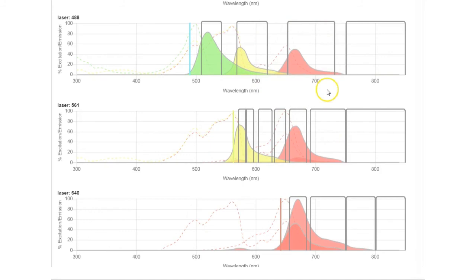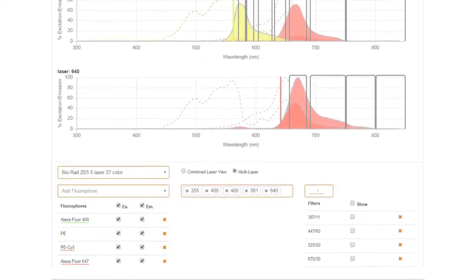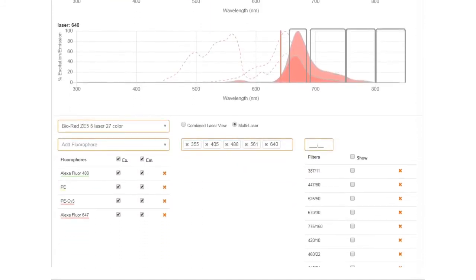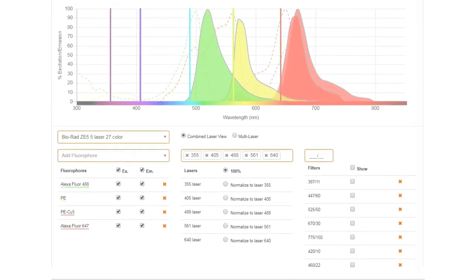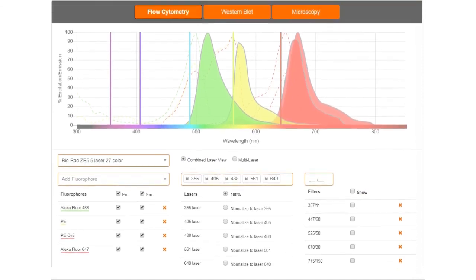In this example, you can predict the expected emission from the 488 nanometer laser. For more information on our Spectra Viewer or to try it yourself, visit bio-rad-antibodies.com.